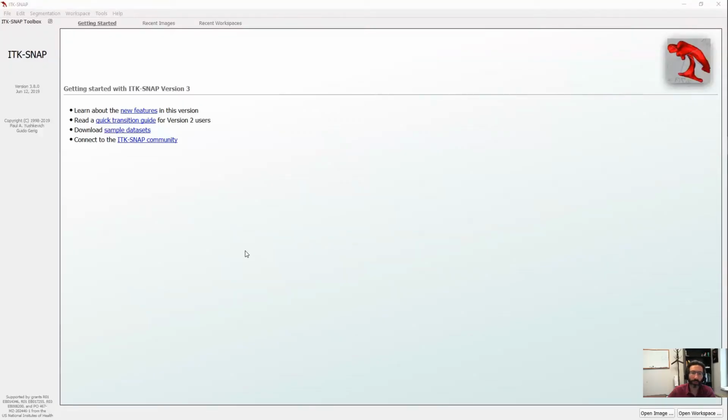Welcome to this tutorial on how to use ITK-SNAP to explore AZBA, the Adult Zebrafish Brain Atlas. I am Professor Justin Kenny, and I'm going to walk you through this tutorial.